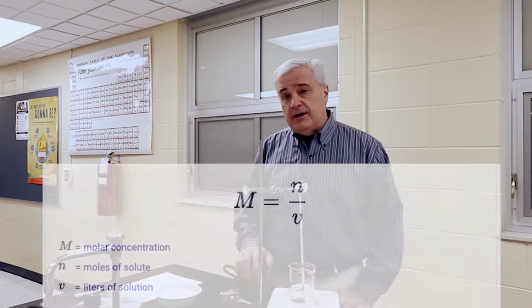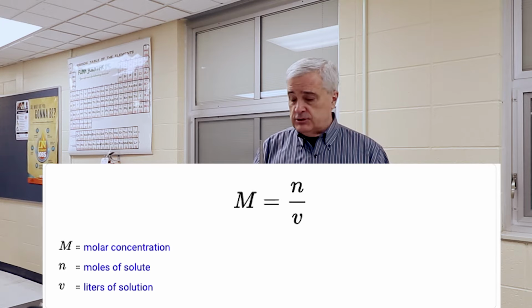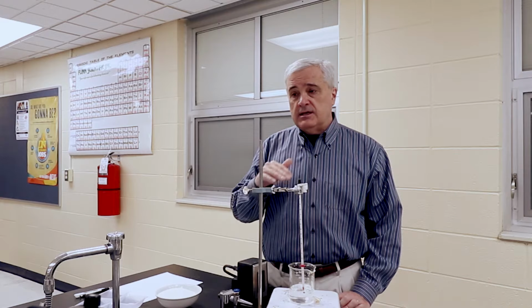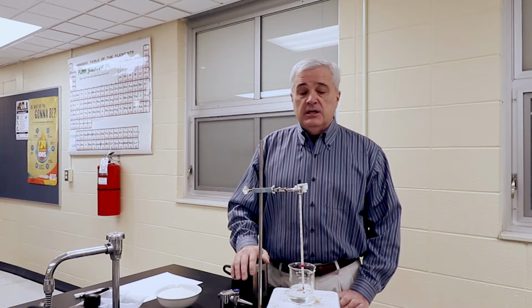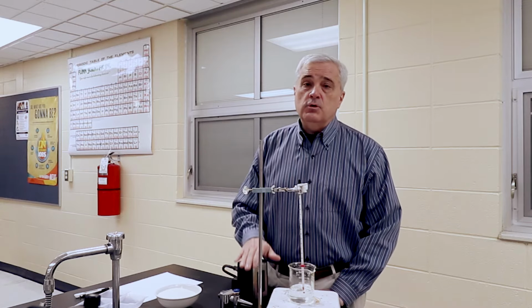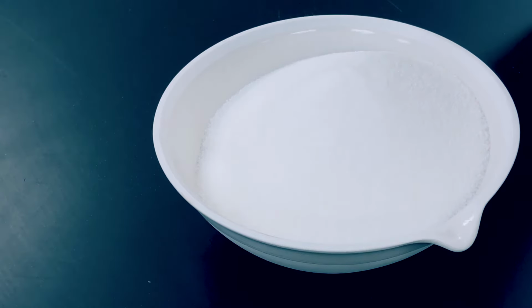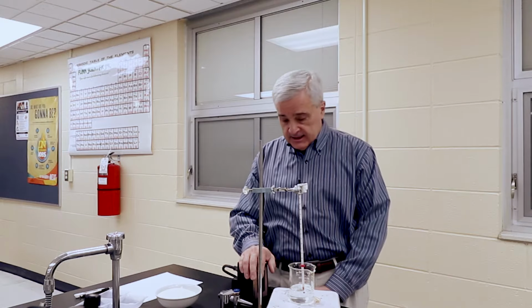Concentrations measured in molarity and finding that saturation point, the maximum amount that will dissolve at any given temperature, and then we're going to check and see how that changes as temperature changes. So that substance that we are going to test is just plain sugar, household sugar, sucrose by name.